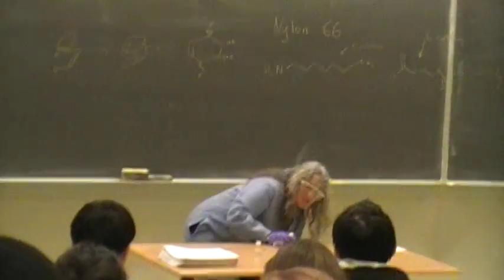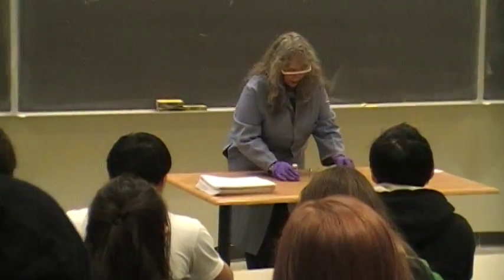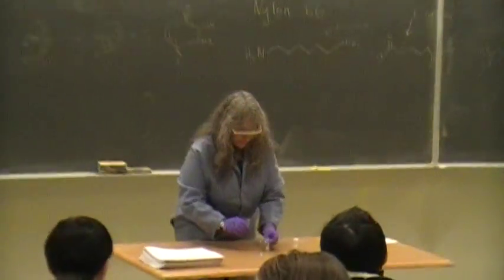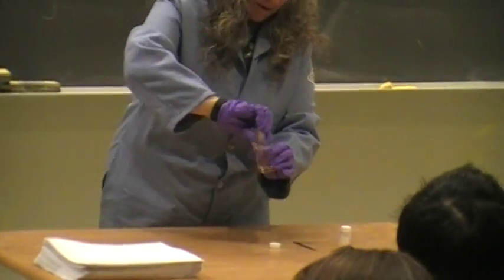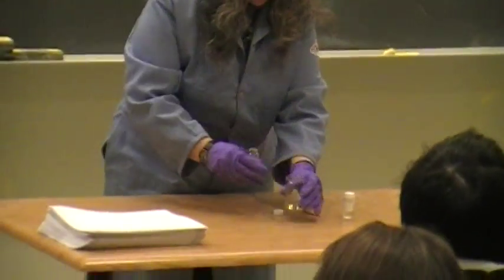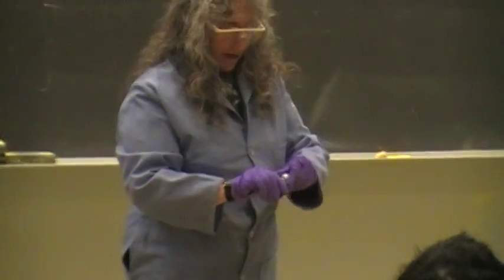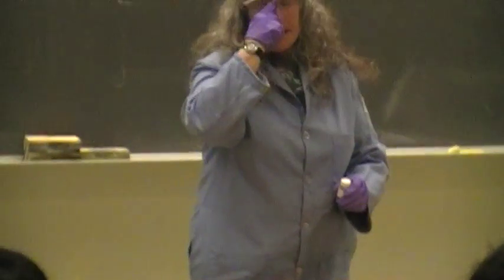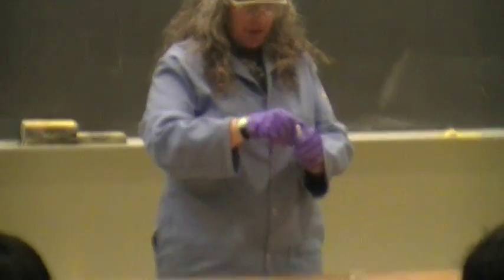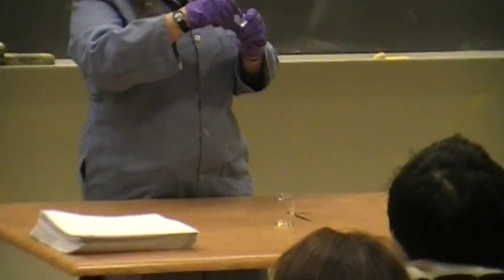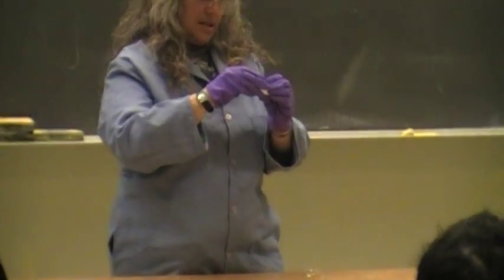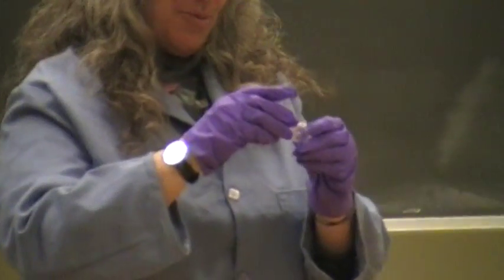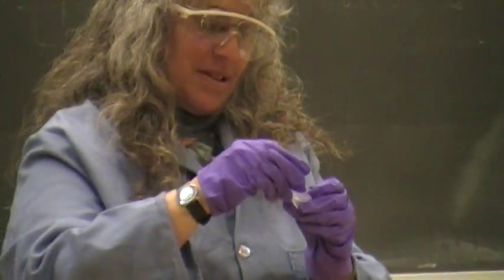So what I'm going to do is pour the aqueous solution in first. And it's all pre-measured, but we usually use 10 mils of that. And then you'll see a little bit of HCl coming off the top when this happens, but not too much. And then, let's see, as long as you don't have to breathe it, you can see a little bit of it's on the edges.